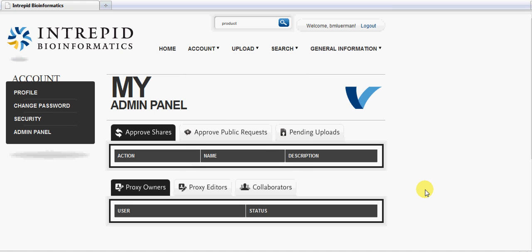In this video, I'll be demonstrating the security functionality of the Intrepid Bioinformatics website. Every record in our database is protected. Once you upload a dataset, you are the only user who can access that dataset. You can, however, subsequently share that information with other collaborators that you choose.